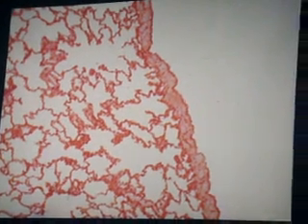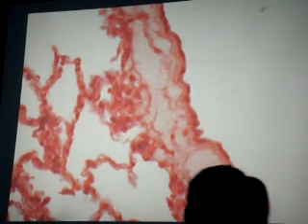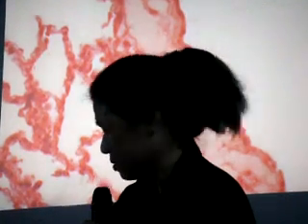Called squamous epithelium. Identify pointed structure: mesothelium. Okay? Ito, ayan. Classify pointed tissue, be specific. Loose, yan. Okay? Pwede ng picture, ha? Dami-dami na ng pictures. Malilito lang kayo.